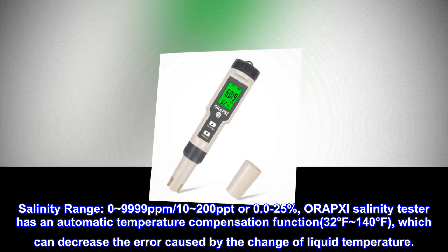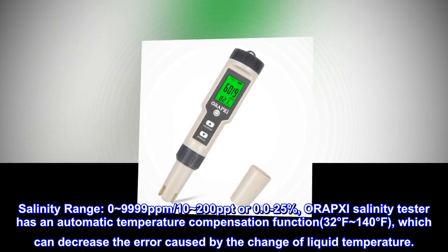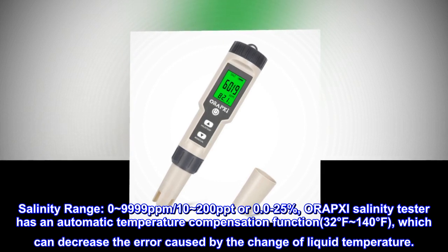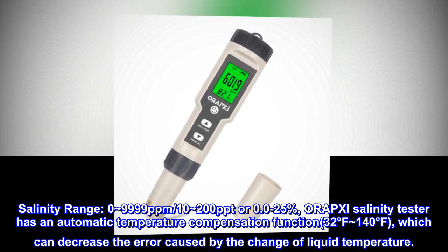Salinity range: 0–9999 ppm, 10–200 ppt, or 0.0–25%. The ORAPXI salinity tester has an automatic temperature compensation function from 32°F to 140°F, which can decrease the error caused by the change of liquid temperature.